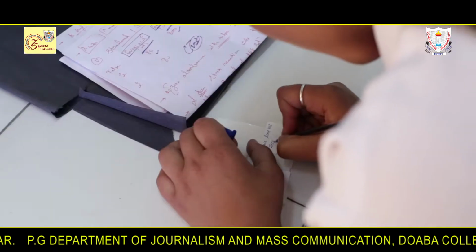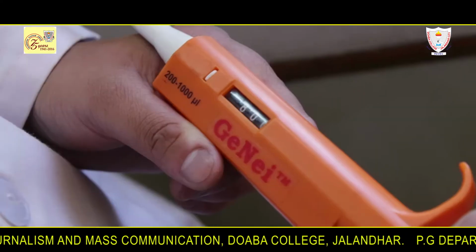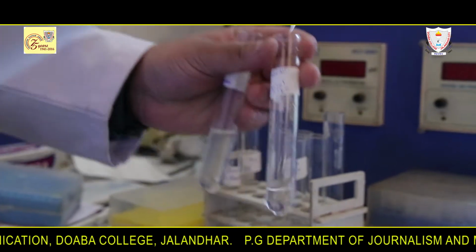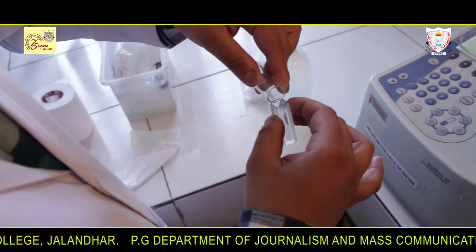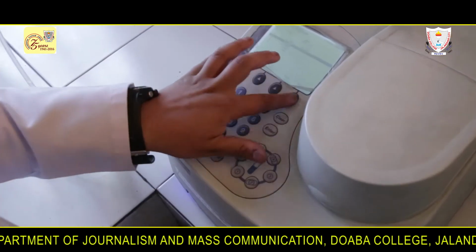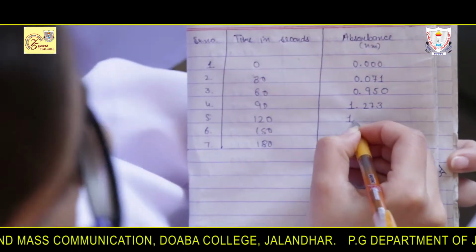Adjust the reading to 0 absorbance with tube 1 blank and start the reaction by adding 800 microliter HRP solution to tube 2 and read the absorbance of the mixture at 470 nanometers at every 30 seconds interval for 3 minutes. Note down the readings and observe the increase in enzyme reaction.